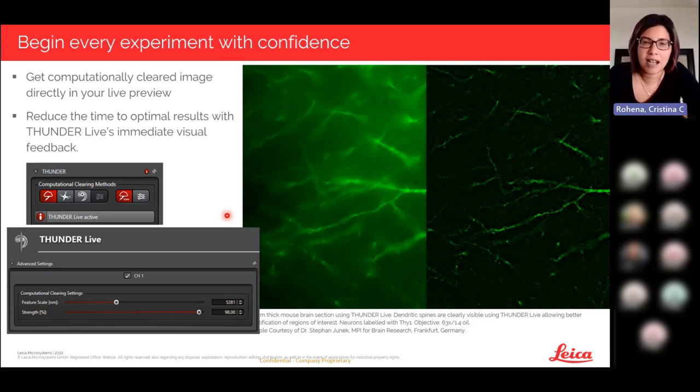And then you may have to go back and tweak those parameters to better fine-tune the processing that you're doing on your image. With Thunder Live, however, you can now get computationally cleared images directly in your live preview, thereby reducing the time to optimal results with Thunder Live's immediate visual feedback.